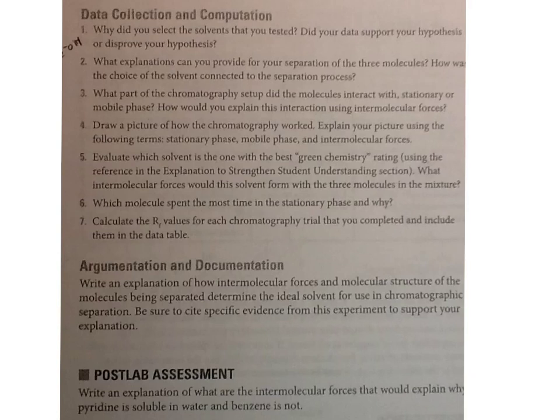So the first one asks you, why did you select the solvents you tested, and did your data support your hypothesis or disprove your hypothesis? Well, I'm not sure if all of you even looked at a hypothesis, but we're going to look at why some of the solvents would have worked the way they should have worked, and then we're going to look at the results that you guys got.